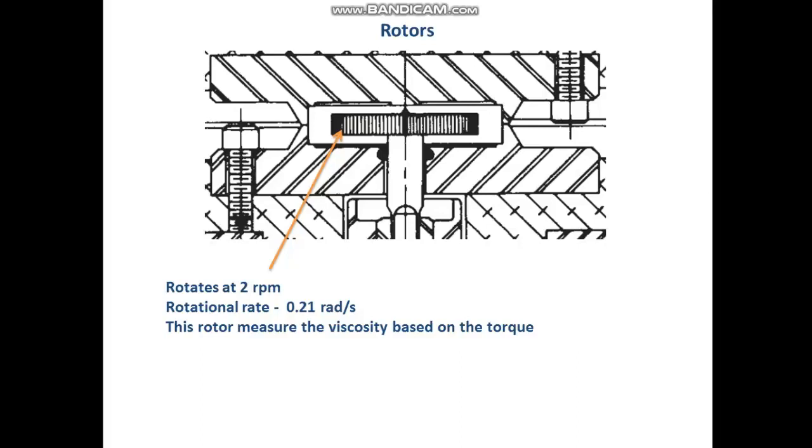So that is the basic principle behind the Mooney viscometer. We load our rubber sample into the cavity, then close the upper die, then we apply some temperature, maybe 100 Celsius, right? Then we start the Mooney viscometer, meaning the rotor will start to rotate at 2 rpm, right? Then it tries to keep 2 rpm throughout the test. Then it will measure the Mooney viscosity and stress relaxation of the rubber sample.